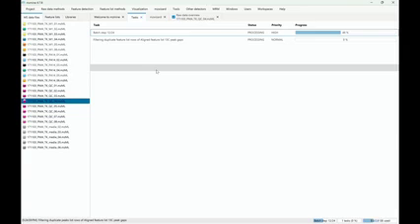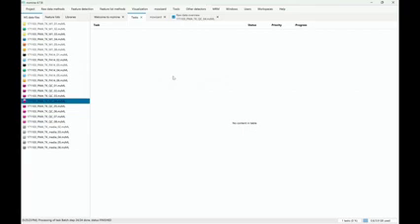If you have a fast local drive, we offload data. So the spectral data, the feature data, even the data in the feature table that we're going to see is all offloaded onto disk. So for 100 gigabytes of data, you don't need hundreds of gigabytes of RAM. You only need a fast drive, and then we can process the files. And for me, it's already done.